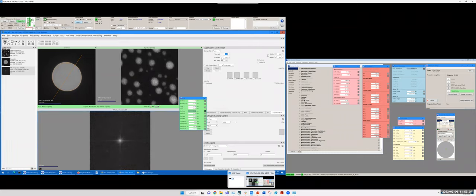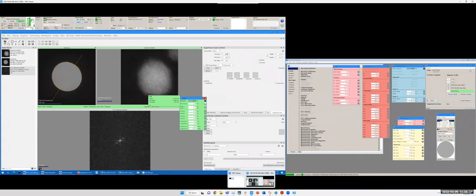That is one way of doing it. Or you can zoom into a single particle and try to tune up the fringes. I personally prefer it this way because I can see it more easily. I'm changing the astigmatism by hand to make sure the atoms show as sharp points. Okay, now I think it's good. So let's change it to 4K.